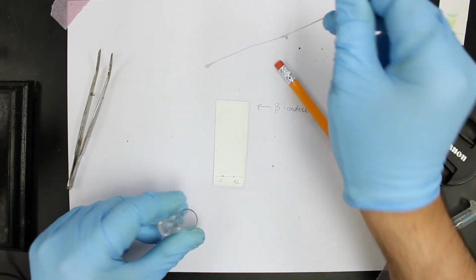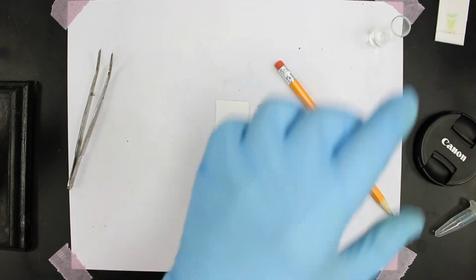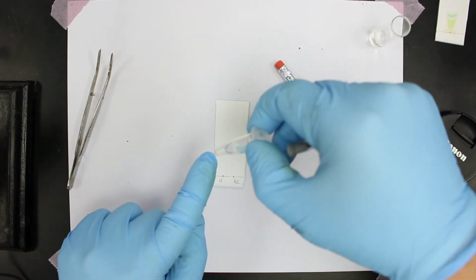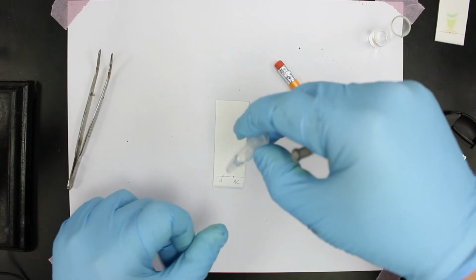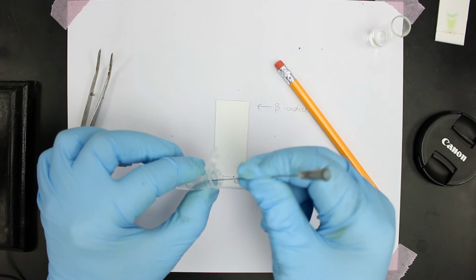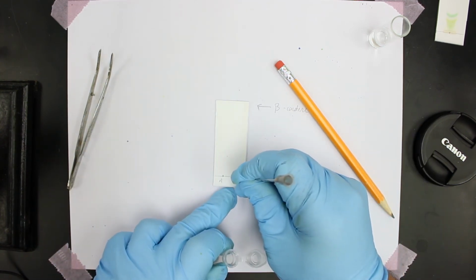Clean our spotter. And now we can get our acid analyte sample. So we've taken a crystal of our acid analyte from the second week of lab, and we can spot it onto our plate for analysis. So take a little bit and spot the plate.